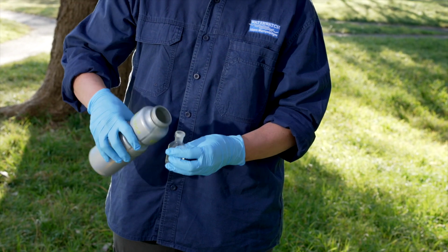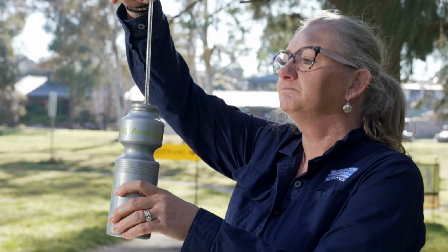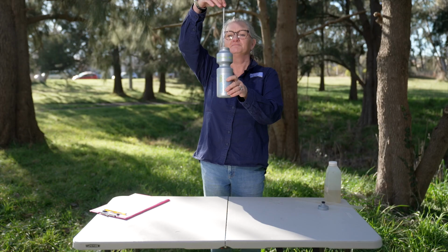Rinse test tubes before and after each test. Close all container lids tightly after use and avoid interchanging caps between containers. Keep your kits away from prolonged direct sunlight and don't leave your kit in a car. By following these safety guidelines and proper sampling techniques, you can ensure accurate and reliable water quality testing results. Thank you for your commitment to maintaining safety and protecting our waterways.